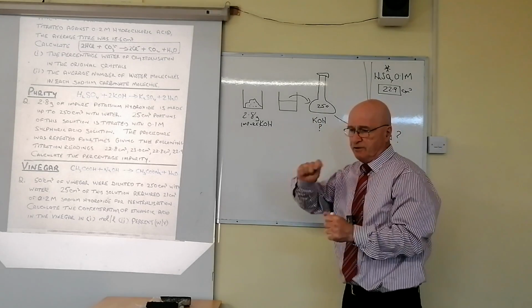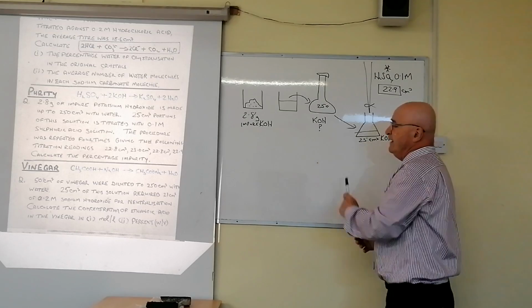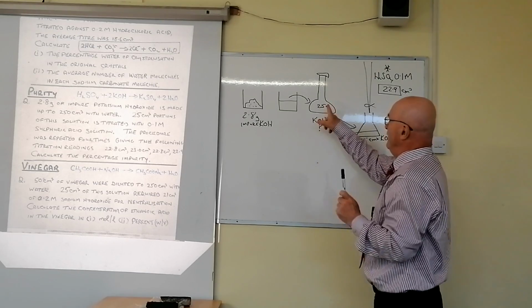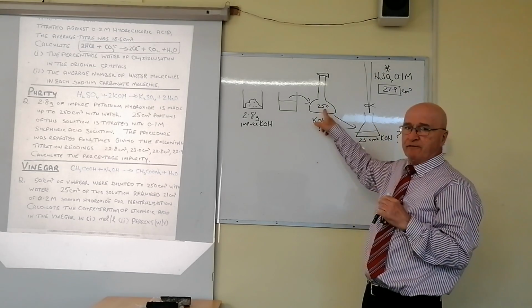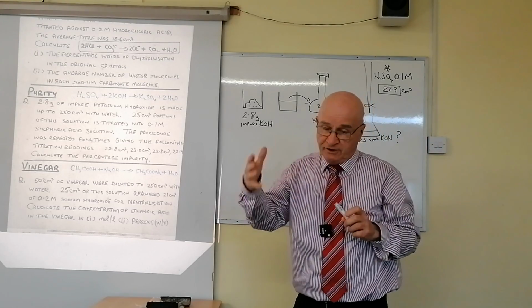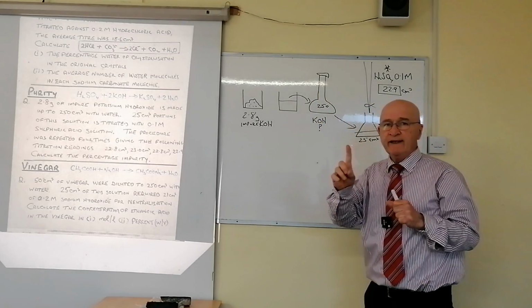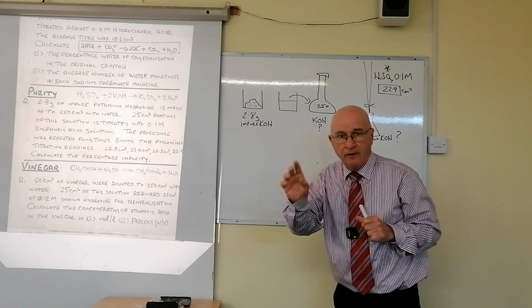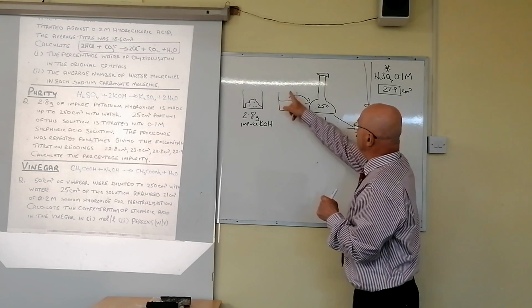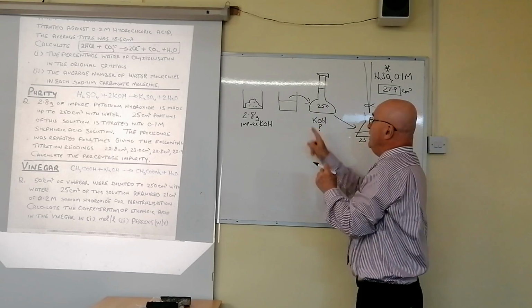You put in some water, stir it, put in some more water, stir it, and eventually you get it totally dissolved, right? And then you must now wash a volumetric flask with deionized water only. Just wash it out with deionized water, very good. Now, you must say this: using a funnel, pour the contents of the beaker into this flask. Okay, very important, using a funnel.